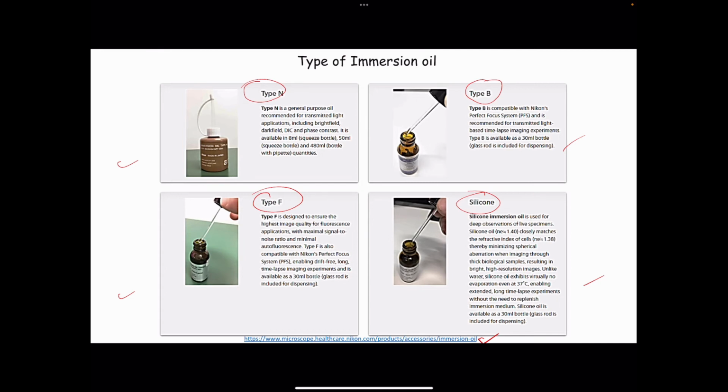So in the oil immersion objective that I showed you, Nikon uses this kind of oil. I will show you what kind of oil, which oil immersion objectives are supplied by Nikon, and which microscopy techniques they are applied to, in subsequent slides. But before that, if you use a non-Nikon oil, what will happen on the Nikon lenses?